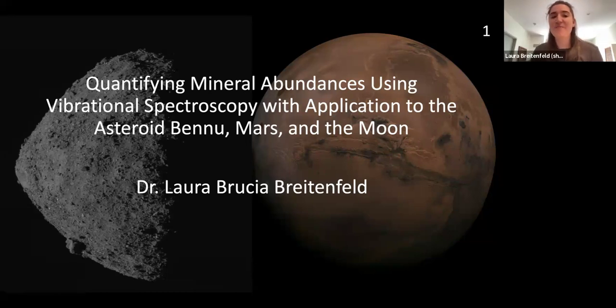So today I'm going to be talking about quantifying mineral abundances using vibrational spectroscopy with the application to the asteroid Bennu, the planet Mars, and our moon.